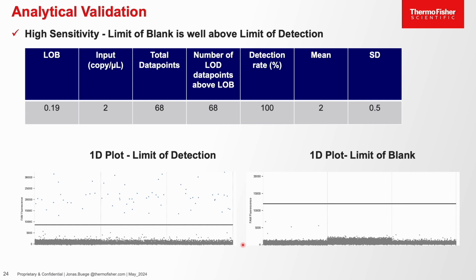Given that the HEK293 cell line used in this assay is of human origin, it is important to conduct the experiment in a clean environment to avoid any potential contamination. This will include following appropriate laboratory practice and wearing suitable PPE to also ensure the integrity of the results that are obtained.